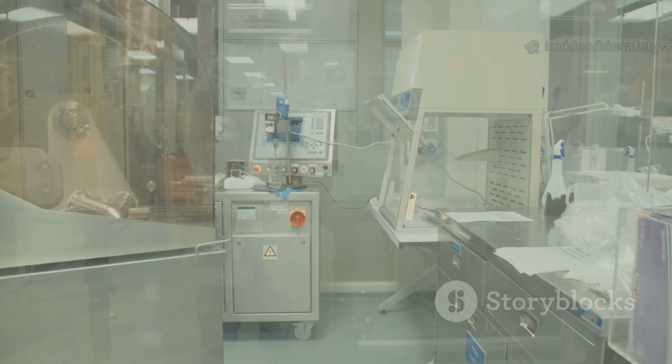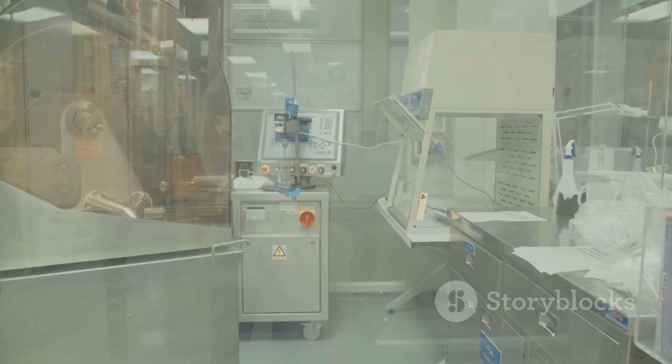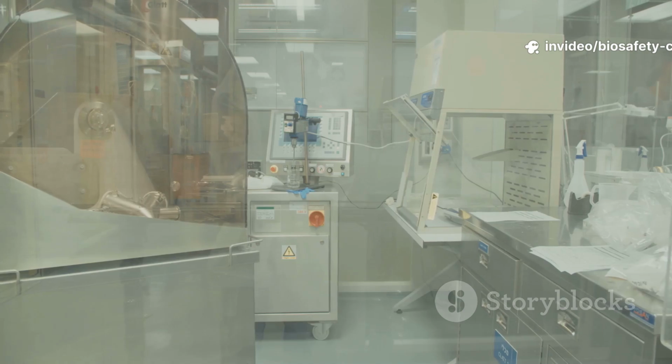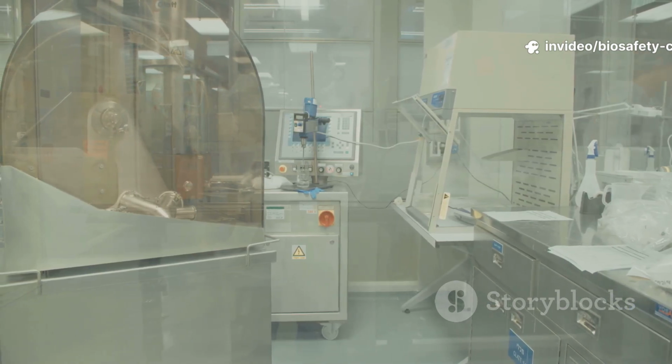Class 2 A1 cabinets have a minimum inflow velocity of 75 feet per minute, with about 70% of air recirculated through a HEPA filter, and 30% exhausted. But they don't have negative pressure plenums, so they're not recommended for work with volatile chemicals.